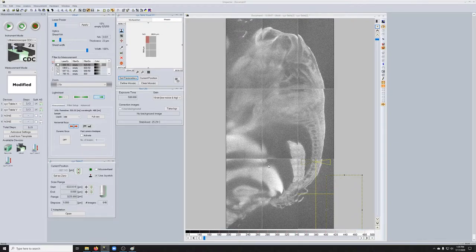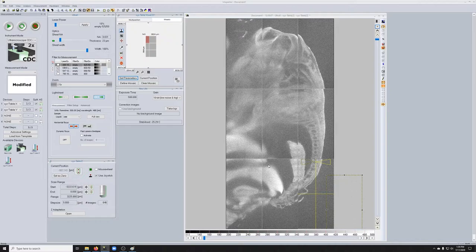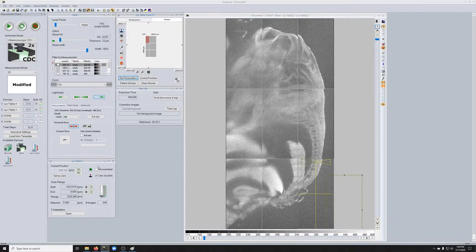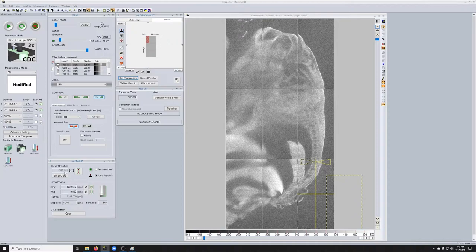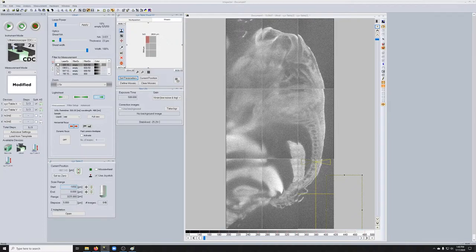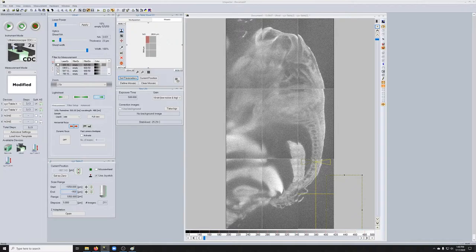So now we're ready to actually take the mosaic. So just in the interest of making this feasible in the time that I have to record this video, I'm not going to take the entire embryo. I'm just going to take 100 microns around where we are right now, which is roughly minus 1000. So I'm going to go from minus 1050 to minus 950.